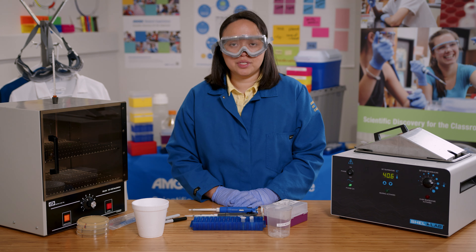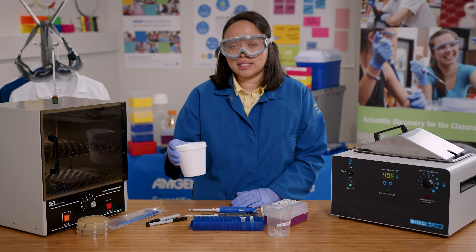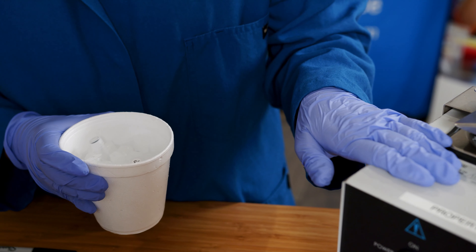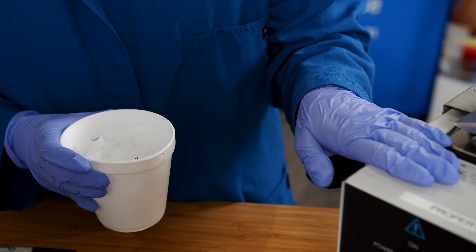Now I'm ready for the heat shock procedure. I'll keep everything on ice until right before it goes into the water bath. It'll be in the water bath for 45 seconds, so I'll need to have the timer ready.